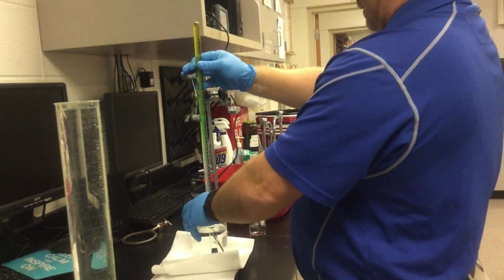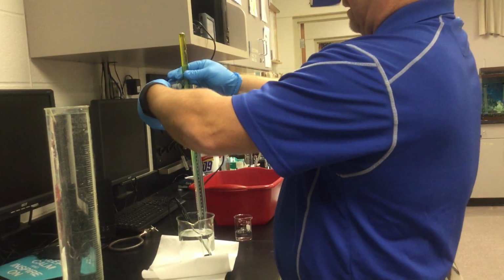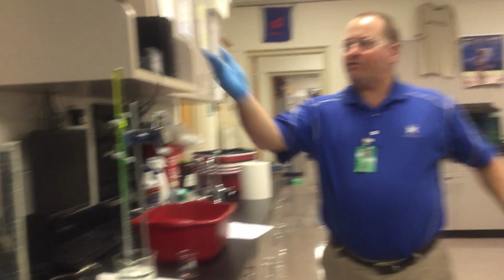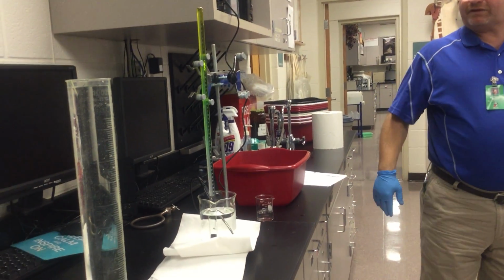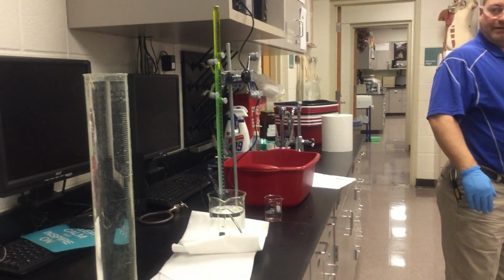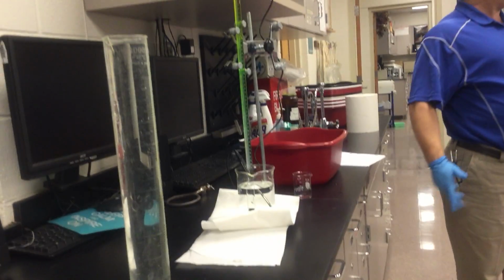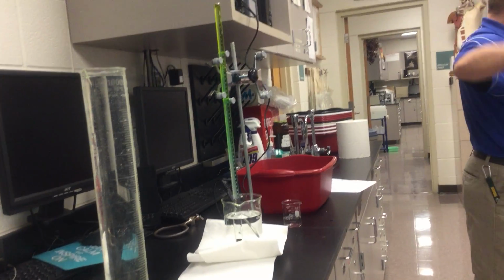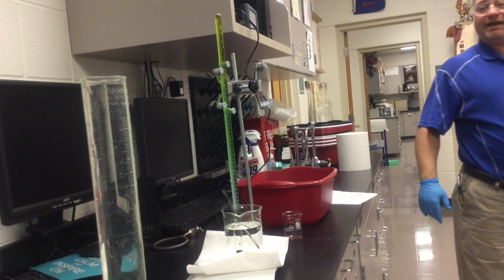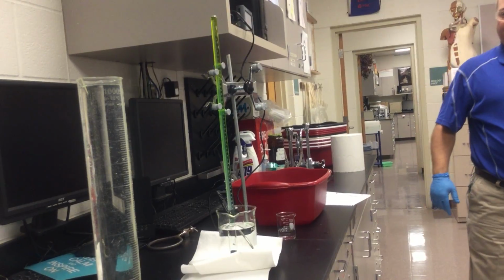It's not going very well. I need to move this over. Get my hand out of the way. And what you should see is what's happening with the acid. Where's it going? It's traveling down. Why do you think so? It has a higher density than the water does.